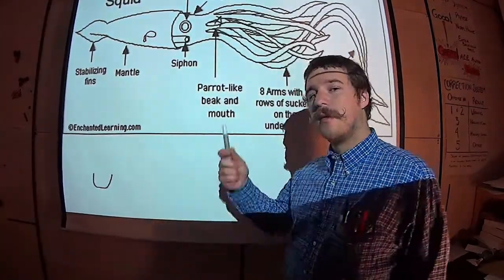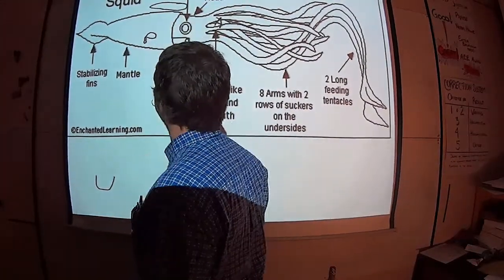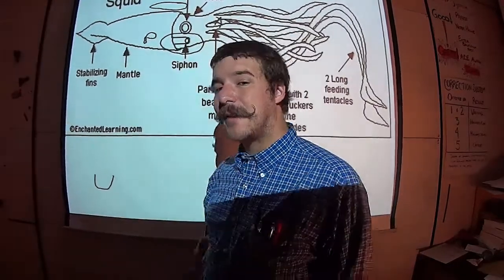What is easy to tell though is dorsal and ventral side. So the dorsal side will be this side that's top right here. The ventral side will be the side with the siphon on it.